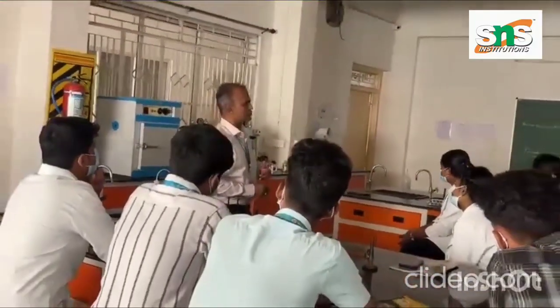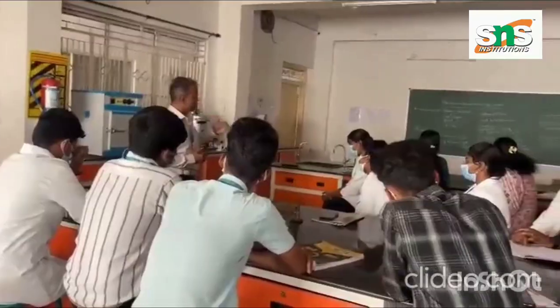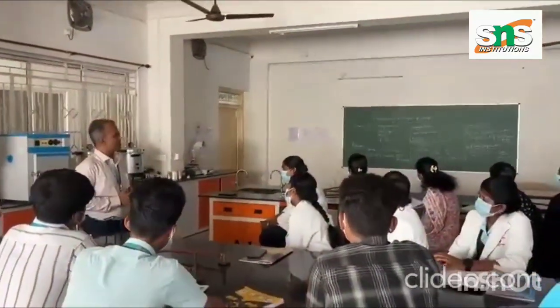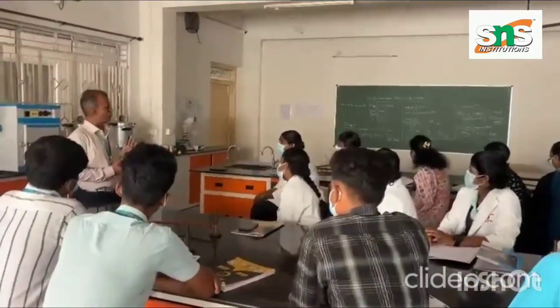Next, as usual, it goes for incubation, for 24 to 48 hours.